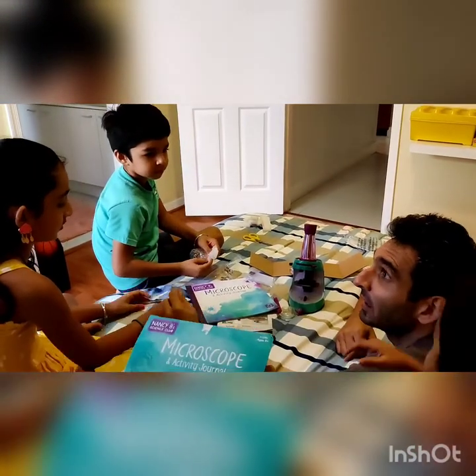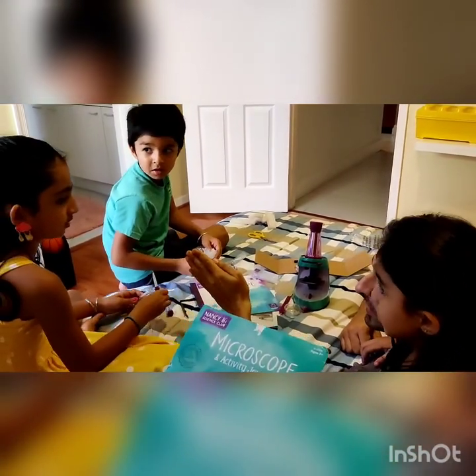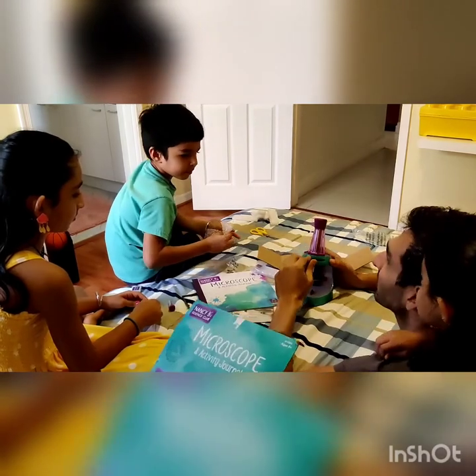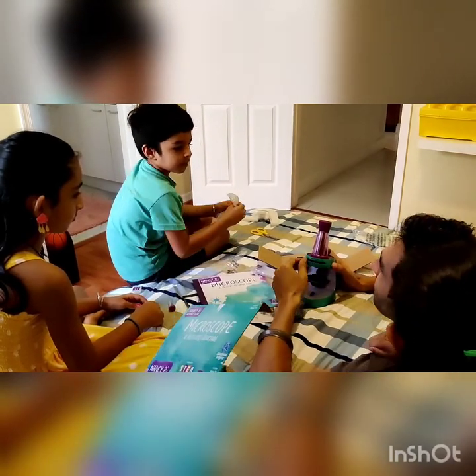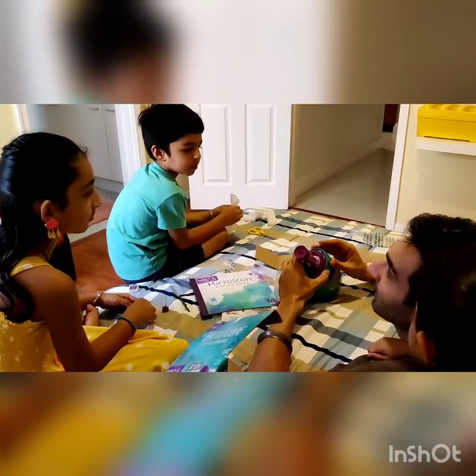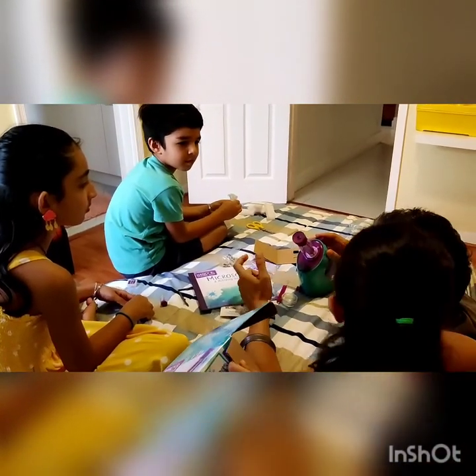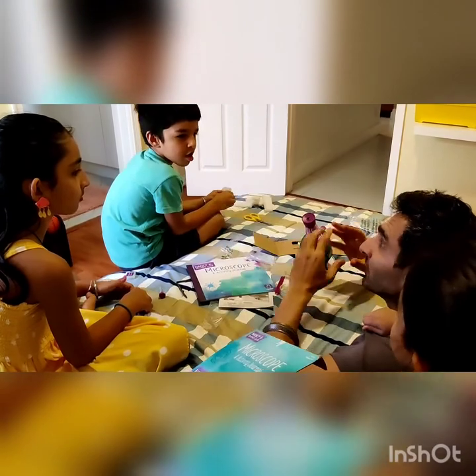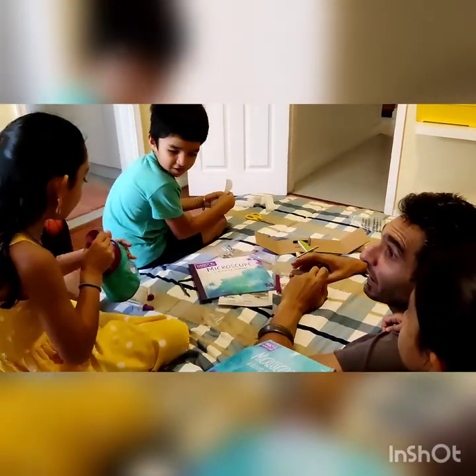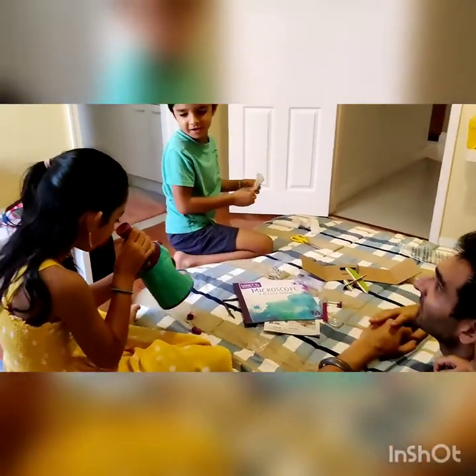Like you could take a bug, cut the bug a little bit, and put it on the slide, so you can look at different things under the microscope. Here you can adjust how big it makes it. Here we'll make it only 30 times bigger. This will make it 100 times bigger. Because it's so tiny that you can't see it, but when you make it 100 times bigger, it becomes a good size that you can see. And then you can make it 400 times bigger.